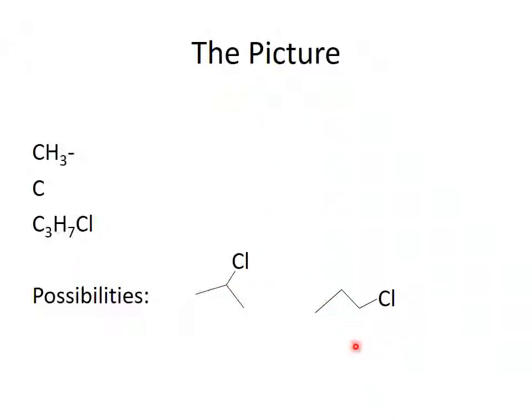If I were to lose a methyl from here, that would put a positive charge right here, and that would be destabilized by an electronegative chlorine skip 1 to it, because chlorine's going to put a delta negative here and a delta positive here, and then to have a positive here would be kind of destabilized. So this is an example of how we would say most likely this is the structure for that because of the loss of the methyl free radical.